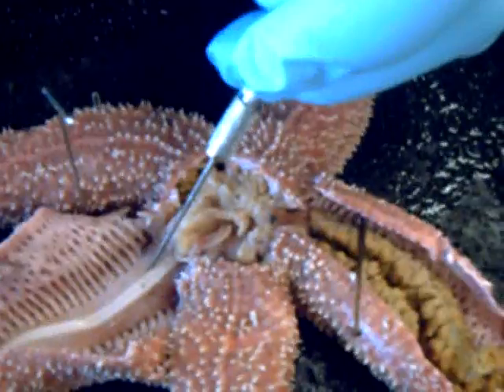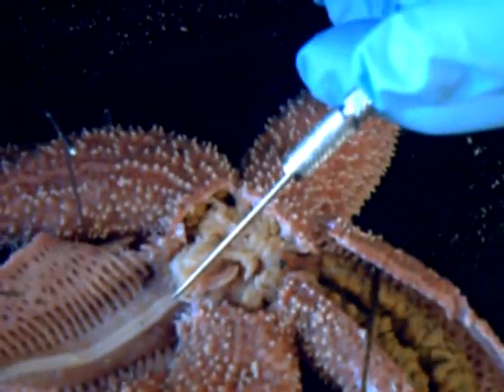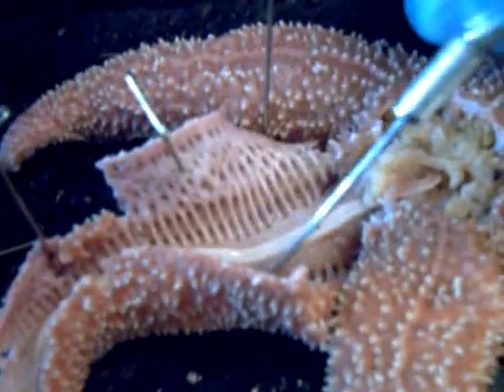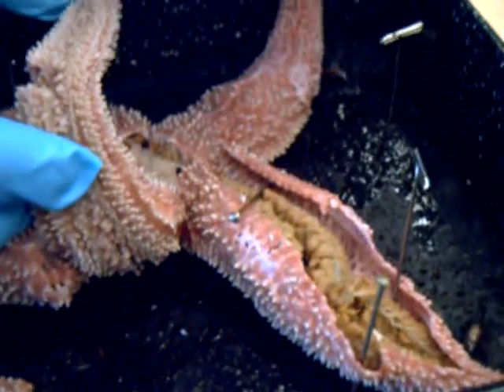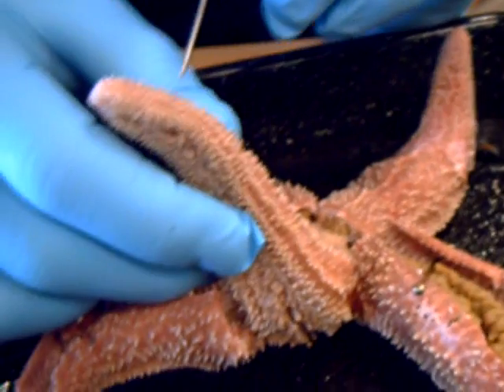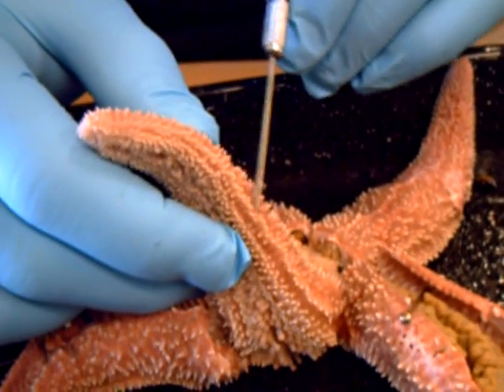This is the vascular ampulla. These are called ampulae. These convey water to the tube feet, which are these right here. Tube feet.